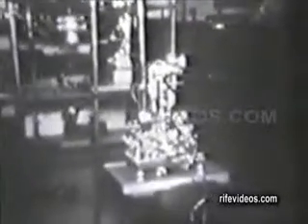This is the optical room in which the microscopes and the Leitz optical bench are shown in the background, with his universal microscope, the Rife microscope, published by the Smithsonian Institution and the Franklin Institute. This was one of 5 instruments that Rife designed and built with the help of his colleagues.